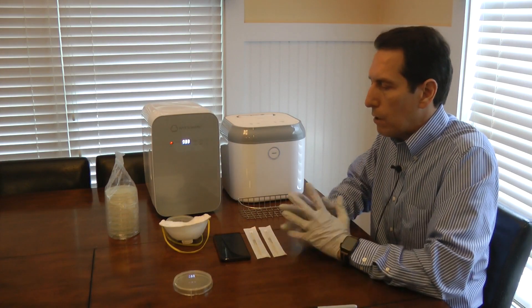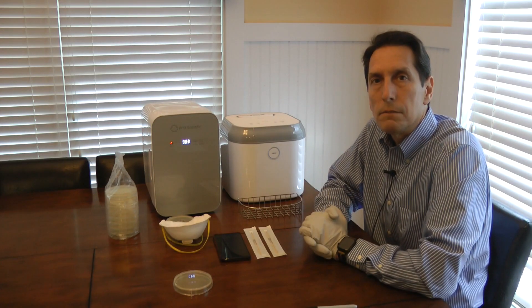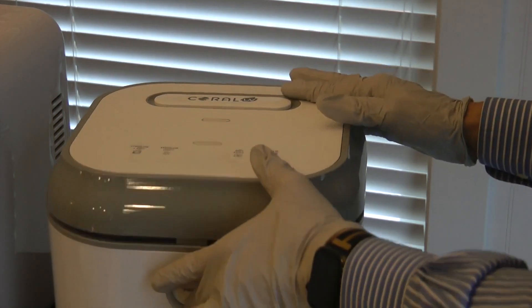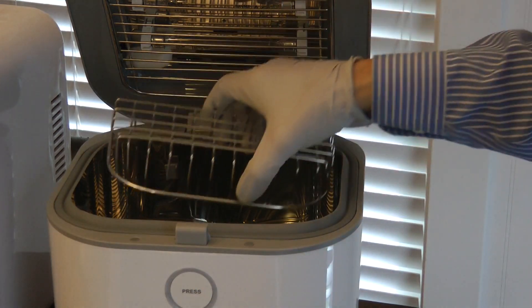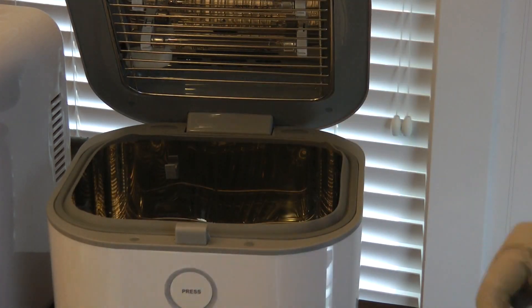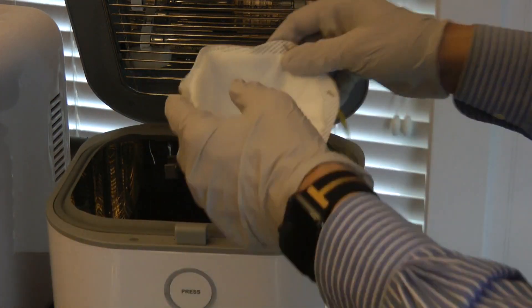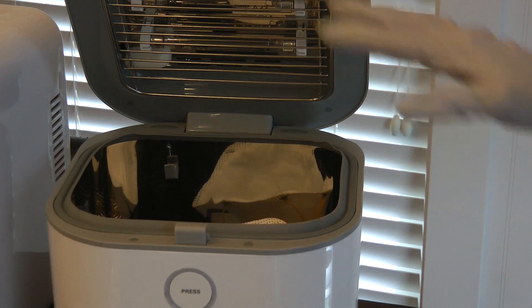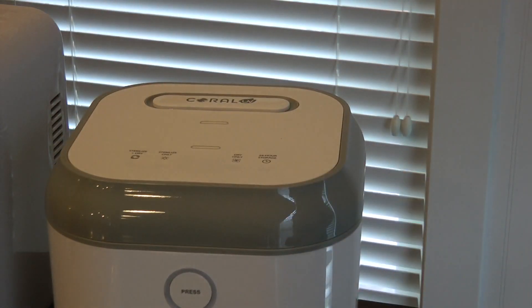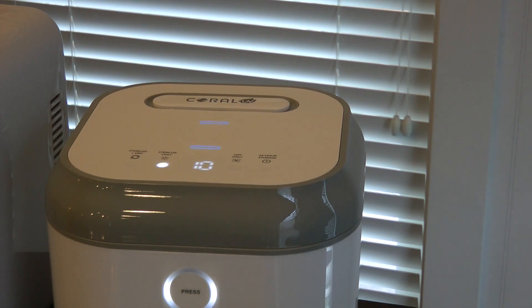Now I want to sanitize the two objects and then repeat the experiment. To sanitize, I'm going to use this Coral UV sanitizer. It comes with a little basket, which I'll set down inside. I'll place my cell phone in first, then set the mask in face up so the UV bulbs at the top shine down on the interior of the mask — which is where I'm swabbing. I'll close it up and use the sterilize-only function, letting it run for 10 minutes. Then I'll take them both back out and repeat the swabbing to create the second sample.